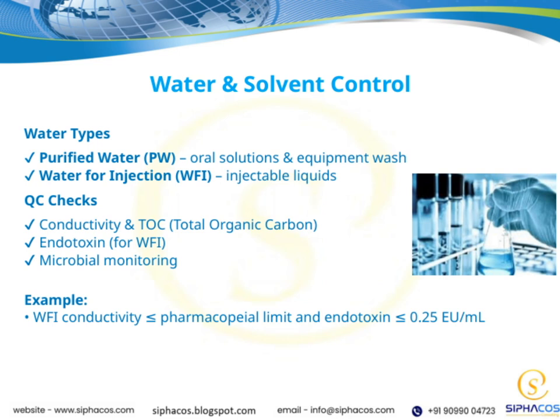Additionally, microbial monitoring is carried out regularly to prevent microbial growth, which could compromise the safety of the water and, ultimately, the product. These controls are vital because they ensure that the water used in our processes remains within the specified limits, safeguarding the quality of the final pharmaceutical products. Maintaining these standards is a fundamental part of our overall quality assurance and compliance efforts.